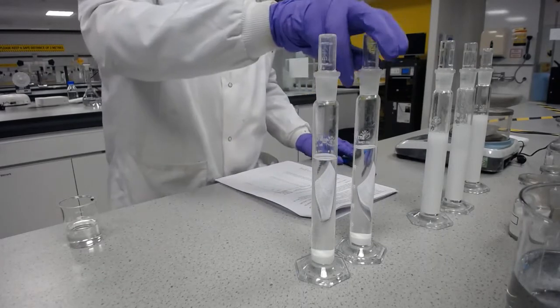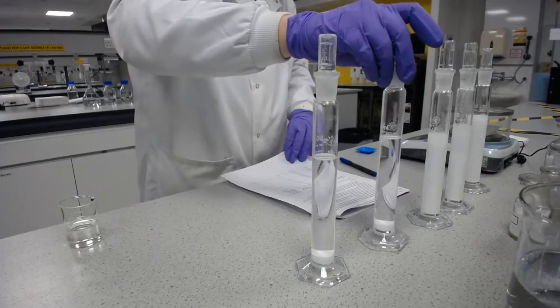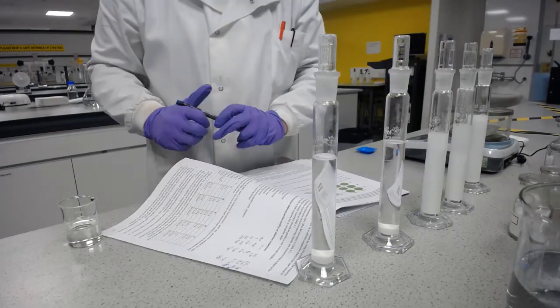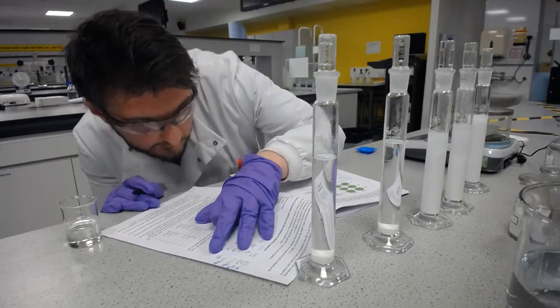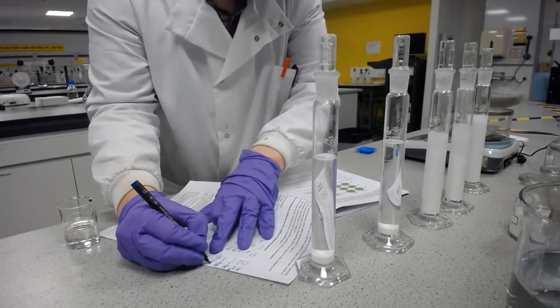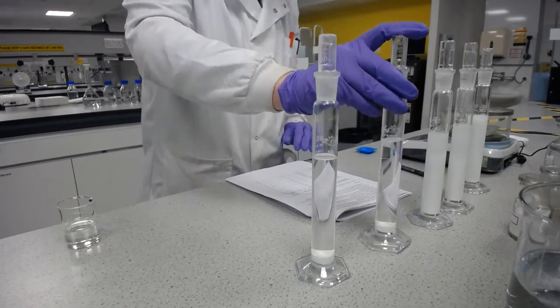Okay, and then we'll do the same for all of these. 120, we had a final volume of around 4 over 50, as with the other one as well. But what's important, as we know, is how well it's going to redisperse.